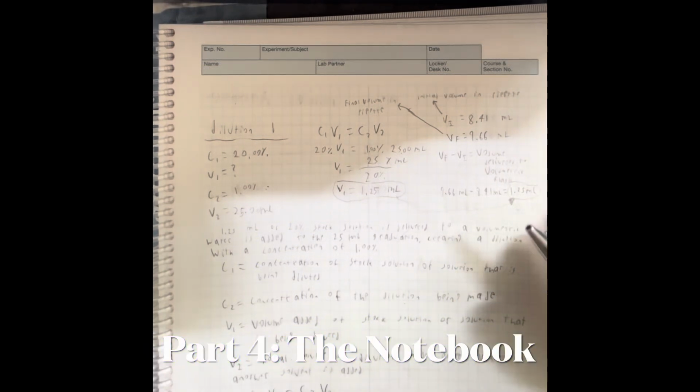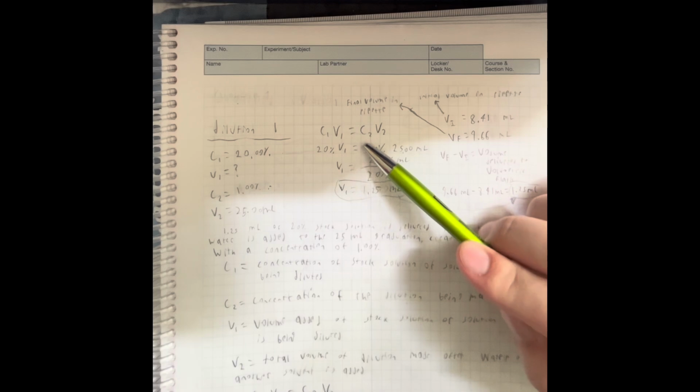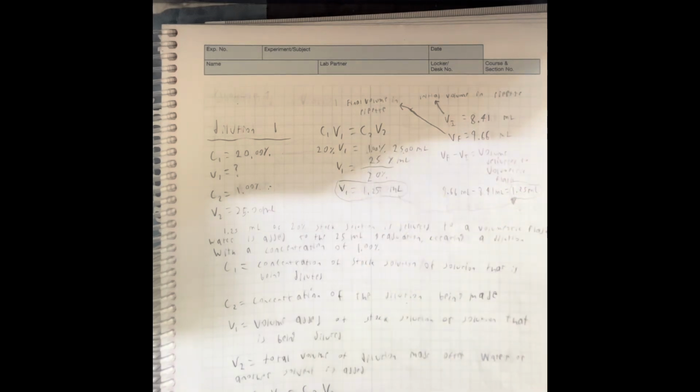Here in my notebook, I show how we made a 1% dilution from a 20% stock solution. I used the equation C1V1 equals C2V2 to find the volume of stock solution I needed to add to the 25 milliliter volumetric flask before diluting the solution.